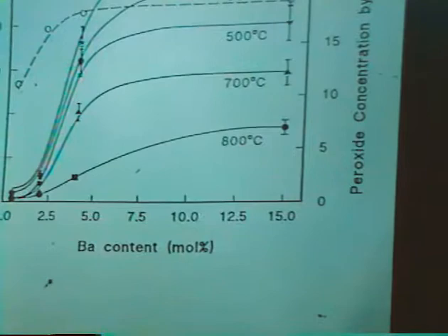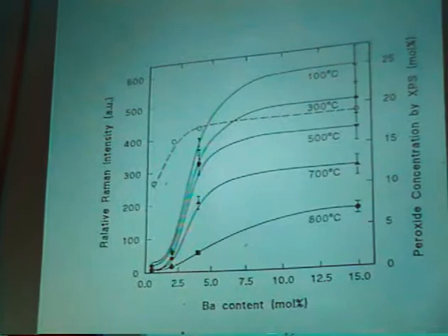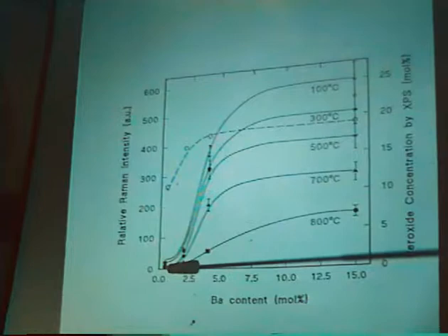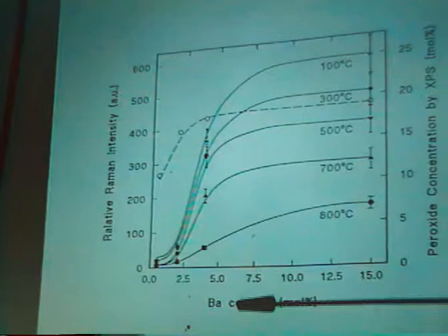Another aspect of the problem was to look at the variation in the peroxide signal as we increased the loading. And what we found was that regardless of the temperature at which the spectra were taken, we observed a sigmoidal shape response with respect to loading.